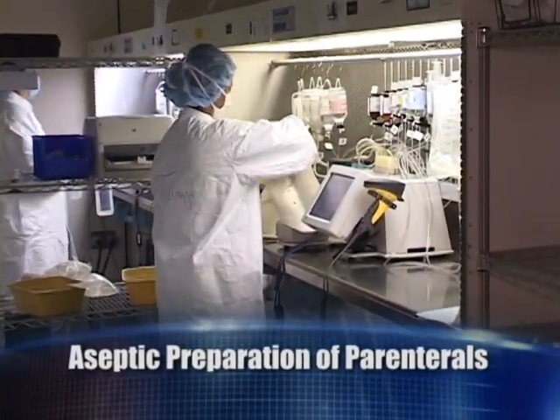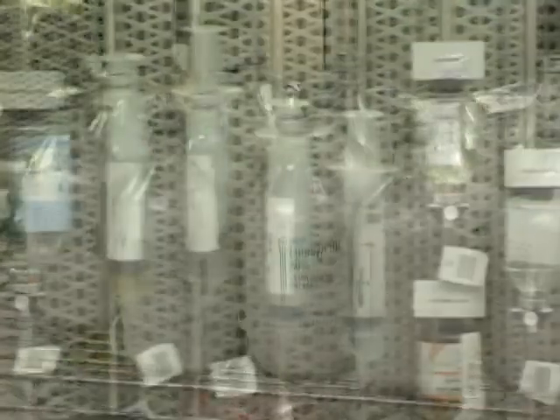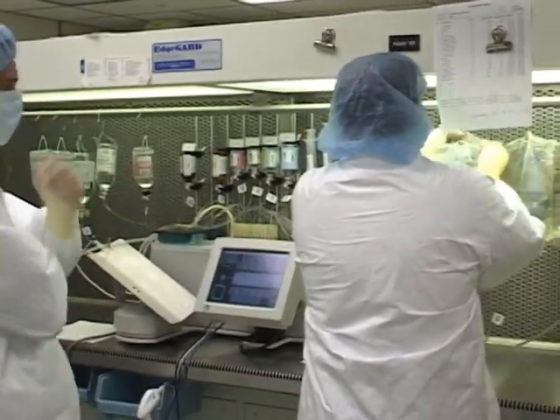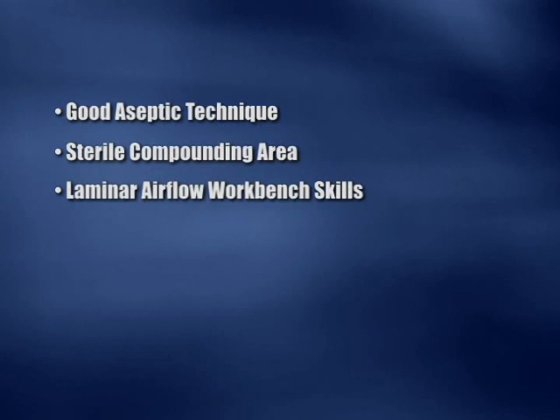As the use of parenteral therapy continues to expand, the need for well-controlled admixture preparation has also grown. Recognizing this need, many pharmacy departments have devoted increasing resources to programs that ensure the aseptic creation of sterile preparations. These programs focus on the following main elements: development of good aseptic technique in the personnel who prepare and administer sterile preparations, development and maintenance of a sterile compounding area, complete with sterilized equipment and supplies, and development and maintenance of the skills needed to properly use a laminar airflow workbench.